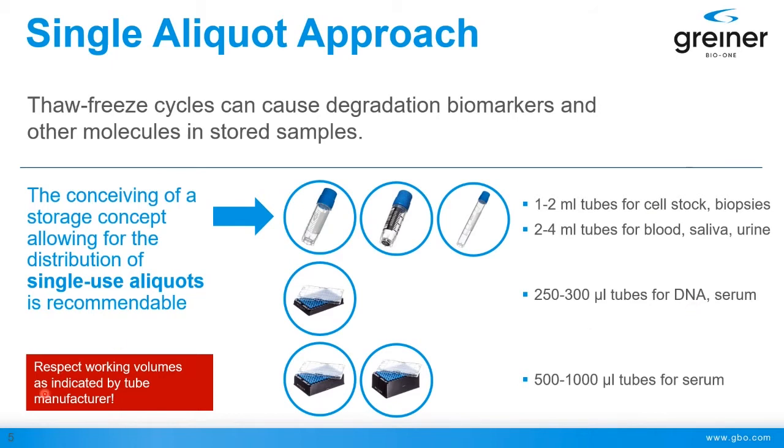It's also important, there's a little note down here, that you respect working volumes, especially if you store in the cold. You should not go above them, because if you fill the tubes too much, tubes can get destroyed and you would lose your sample.